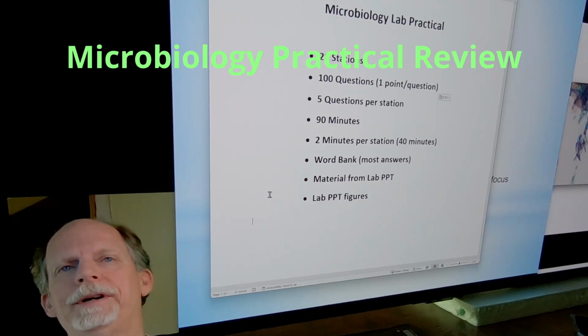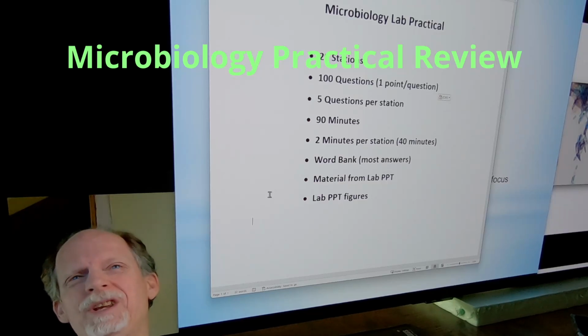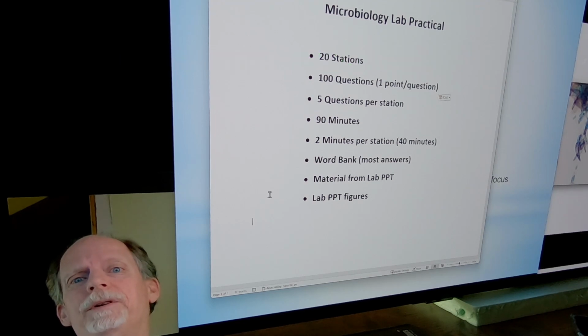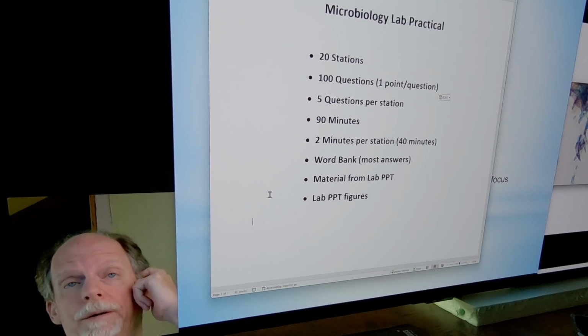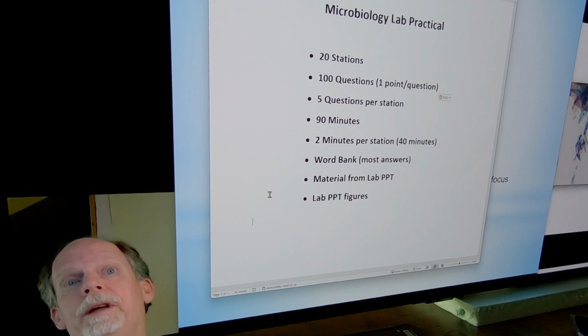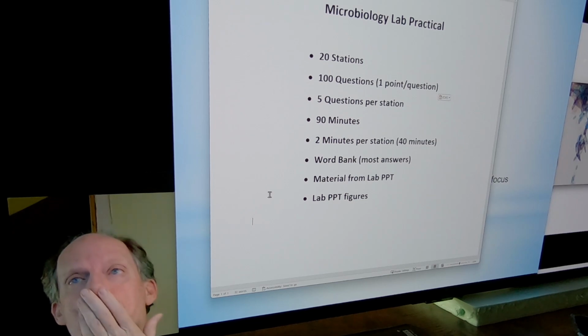Hi, Dr. Roos here. This is going to be a quick video on a review for the practical, and mainly this is for students that aren't taking me for my lab. Maybe an adjunct is doing your microbiology lab, and I just want to make sure that everybody is getting more or less the same sort of input for what to expect for the practical, because we give the same practical the adjuncts that teach.